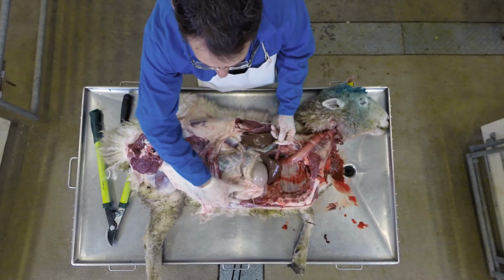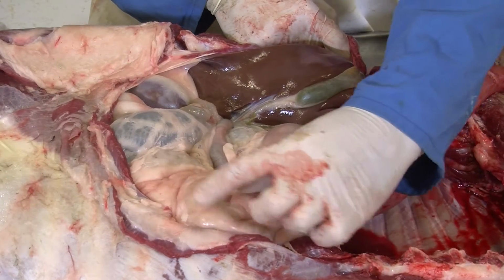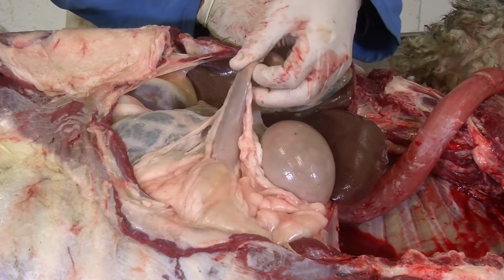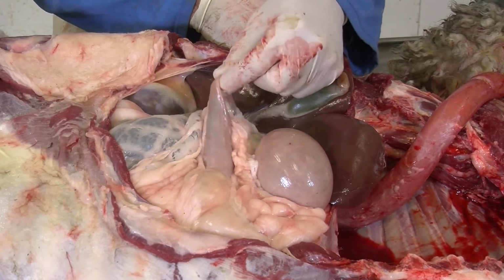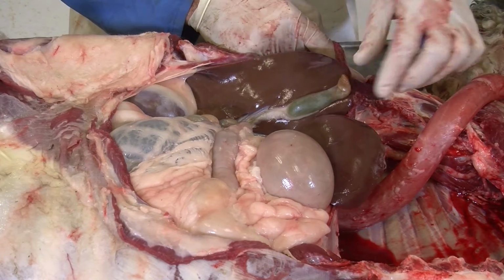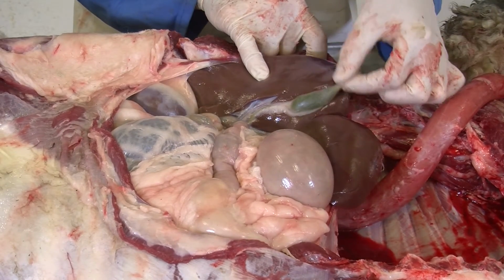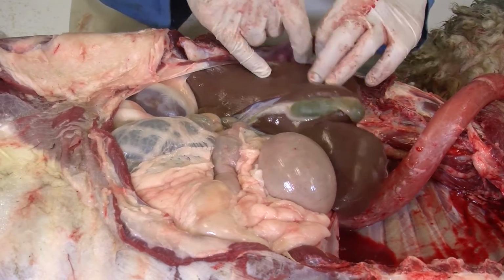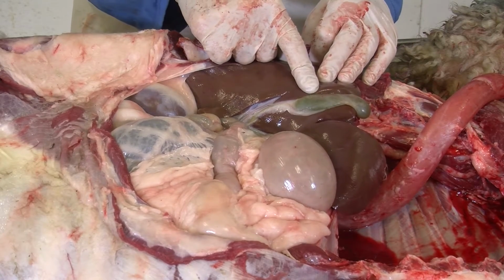So this here is the last stomach. It's the very end of the last stomach. And then we have this, which is the start of the small intestine. So the material's coming out of that stomach into the small intestine. At the start of the small intestine, you have the gallbladder emptying into the small intestine, and what it's emptying in is this fluid in here, which is the bile.